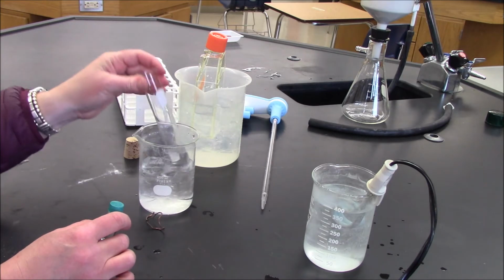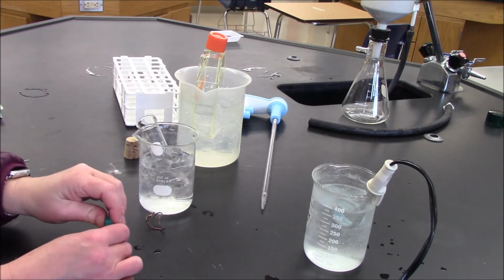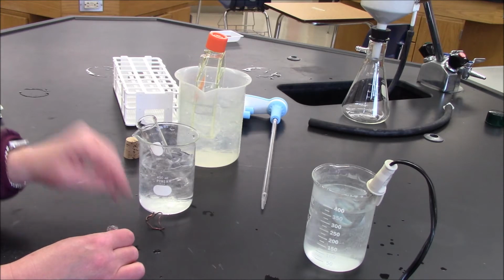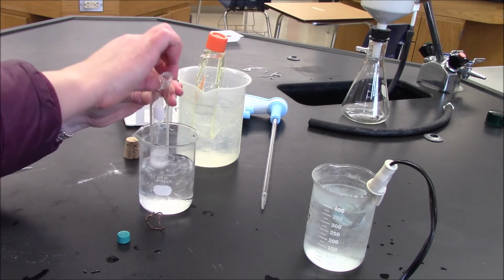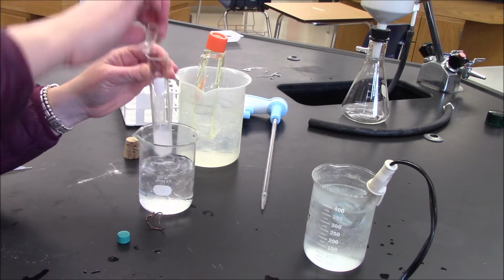Here's my test tube. I've had my distilled water on ice. And hopefully what you can see is the formation of white crystals.